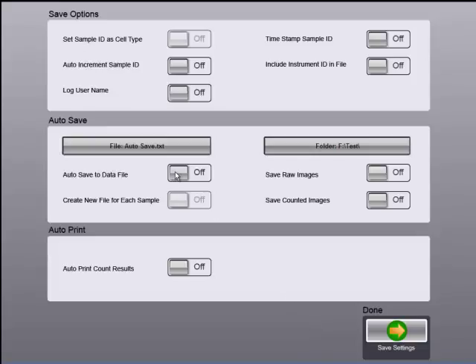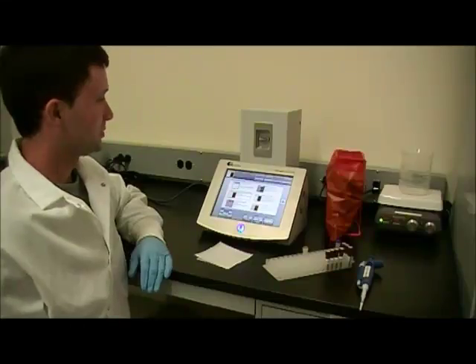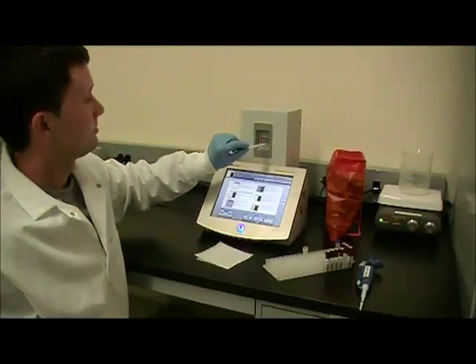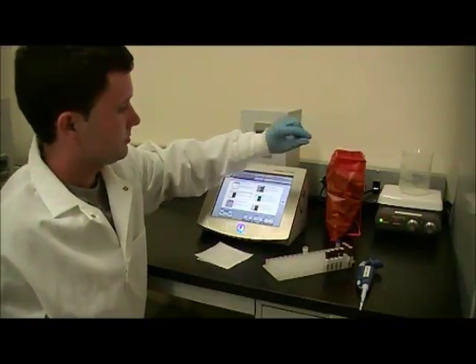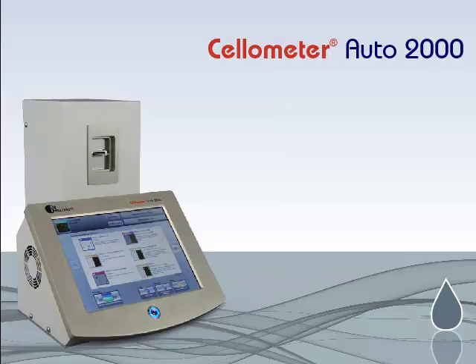Cell images and results can be auto-saved to a specific network location. The all-plastic self-contained counting chamber is easily removed after use, eliminating wash steps and potential contamination.